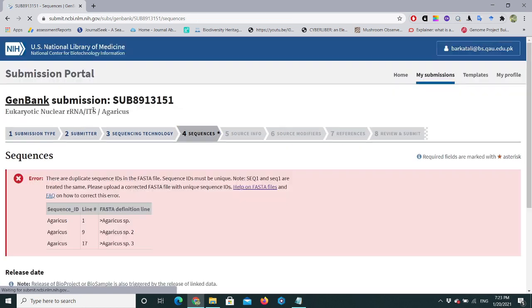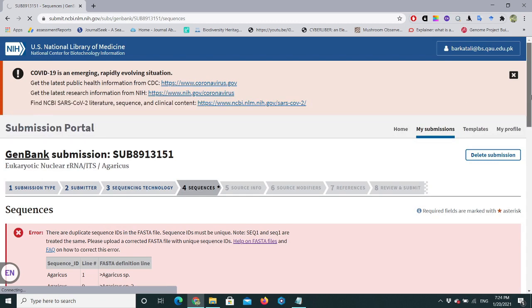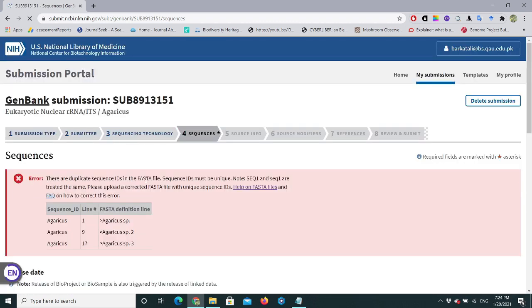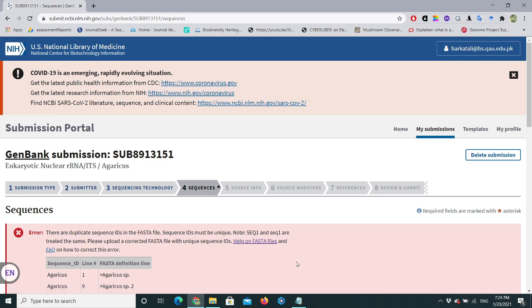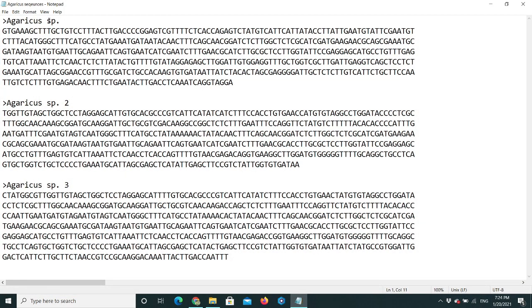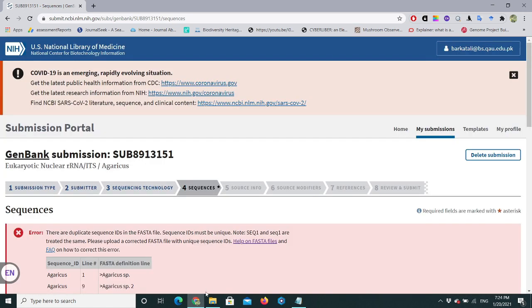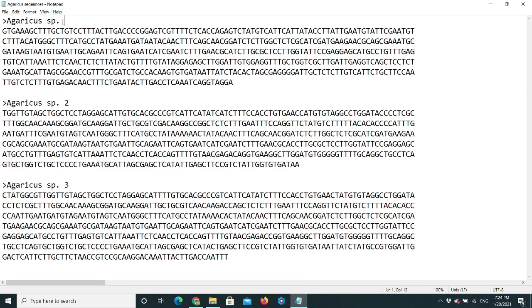After processing, we got an error: there are duplicate sequence IDs in the FASTA file. Sequence IDs must be unique. So let's fix the IDs in the file — I'll rename them agaricus1, agaricus2, and agaricus3, save the file, then delete the uploaded file and choose the corrected file again.